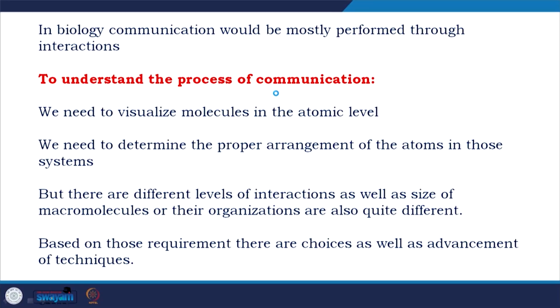So, people are solving the structure of the entire virus, and with that level of organization, with that level of size difference, we need different techniques. So, based on those requirements, there are choices as well as advancement of techniques.